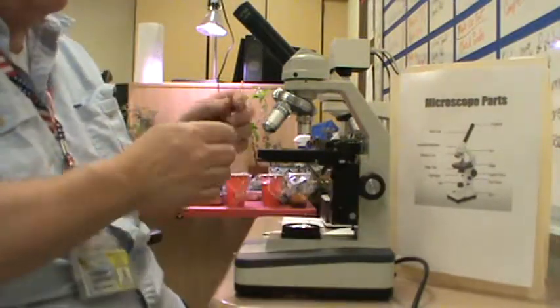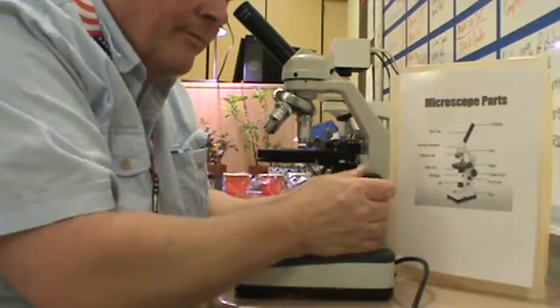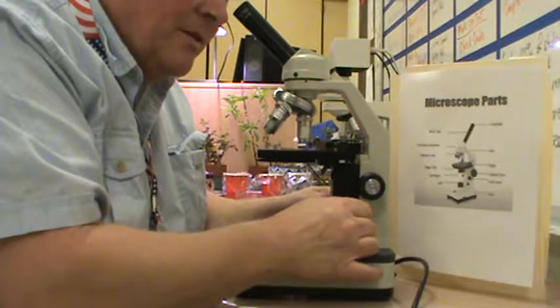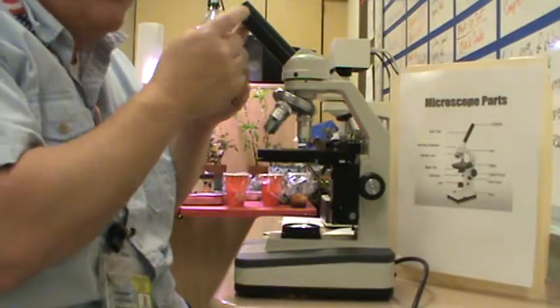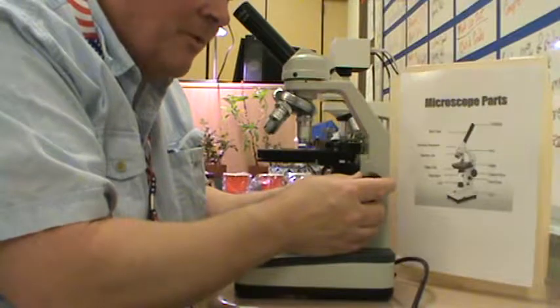I have this in focus. I can now rotate to medium power, and I'm going to use the fine focus to bring that into focus so I can see what the pointer is pointing at. A lot of these will have a pointer in the eyepiece that you just turn a ring, and it will turn the pointer so you can point it at different things in your sample.